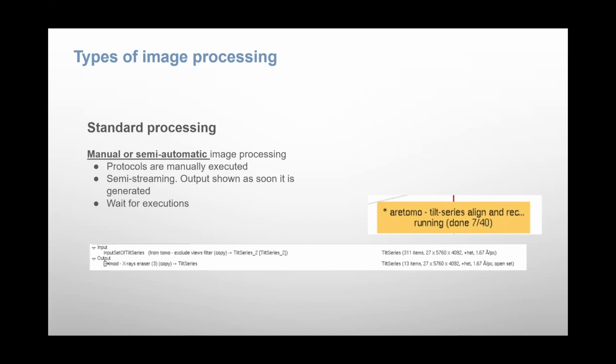Once the CTF estimation finishes, I carry out the tilt series alignment, and so on with the tomogram reconstruction and later with picking and subtomogram averaging. This is the standard processing, in which one protocol or one step is executed after the other. This is how we generally process.